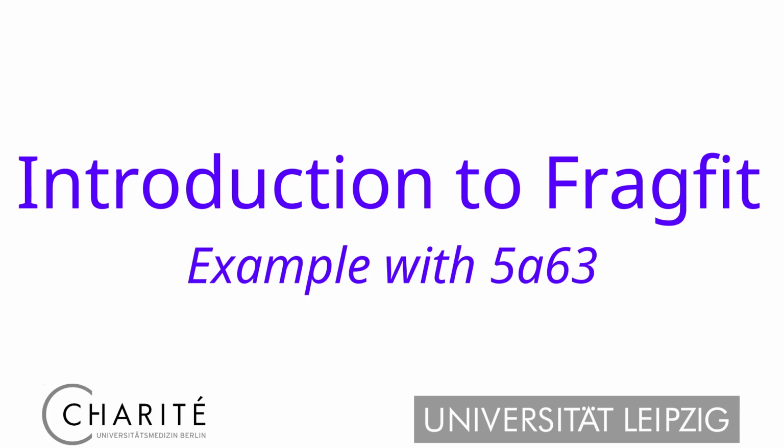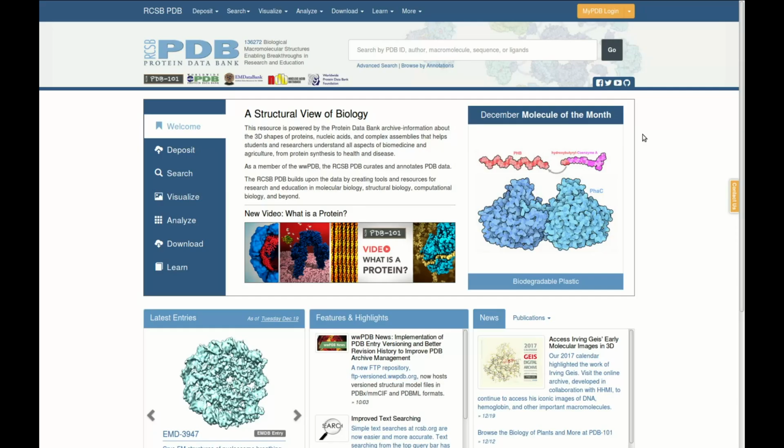This is an introduction to Fragfit. The example we use here is the PDB 5A63. The first thing we do now is to go to the Protein Data Bank and download our protein.